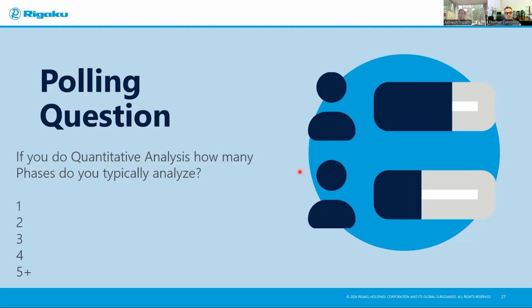The other components you are still trying to get. But fixing the one component, because you're adding it in a fixed amount, makes your amorphous results very good. So as long as there is not too much overlap, internal standard does better than external standard. Okay, perfect. All right, one last question, then I will launch the poll for everybody.